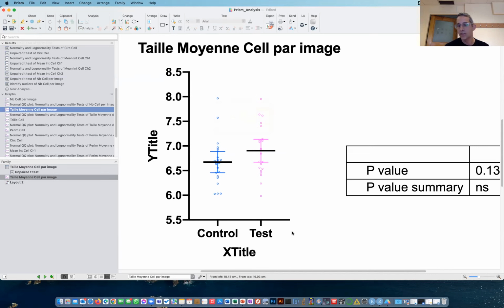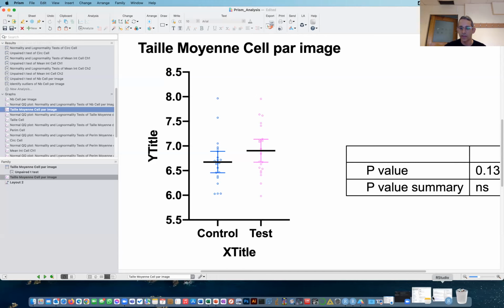They ask you to just make the figure, and sometimes they ask you to provide the data, but this is not sufficient. You really need to track your data and how the data has been processed. If someone wants to reproduce your experiment, they should be able to do that with all the information you give. If I want to know where this value is coming from, I should be able to go back and find it. This is how we do this kind of analysis.